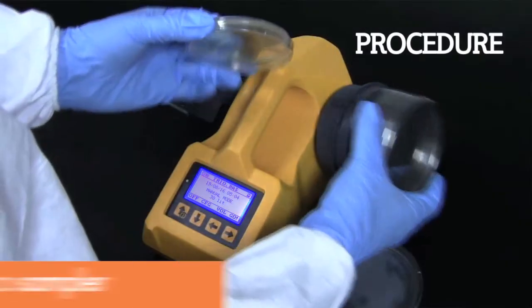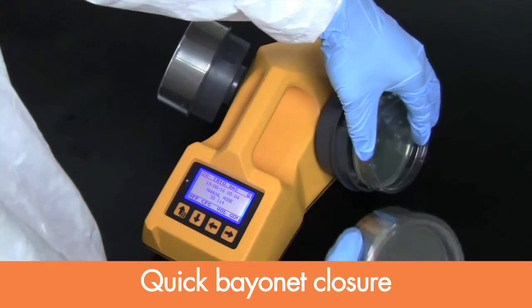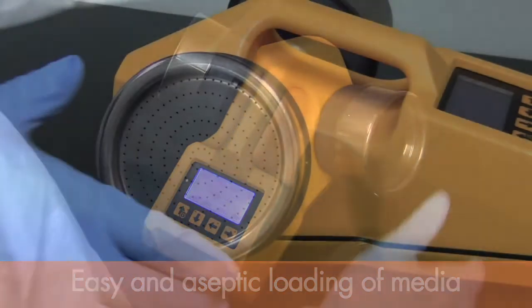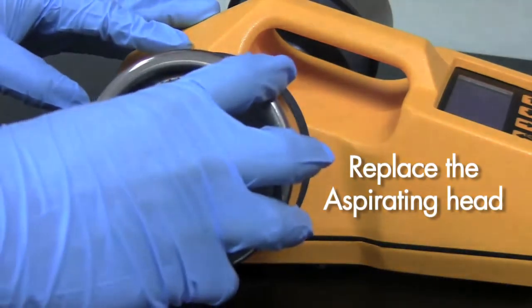First, the operator loads the desired media into the sampler prior to sampling. The quick bayonet closure style of the unit allows for easy and aseptic loading of media. Open the aspirating head and place the plate in the spring clasps, then replace the aspirating head.